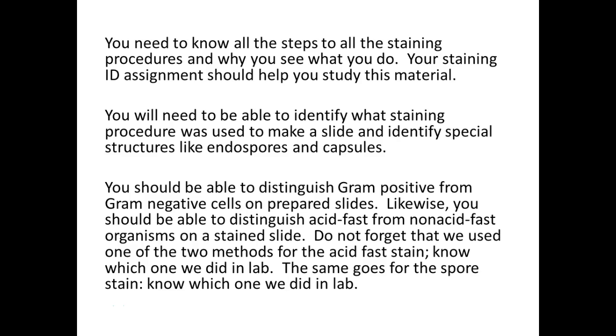Okay. Again, with the capsule stain, why do we do the negative stain portion? To stain the background. And then the next portion we're staining the cells, right? And the capsules don't stain, right? That's why they look clear.